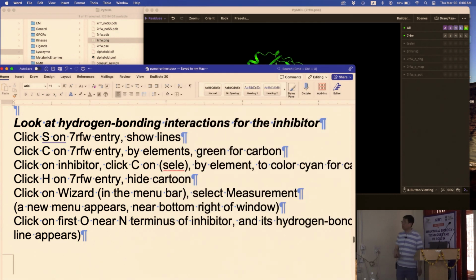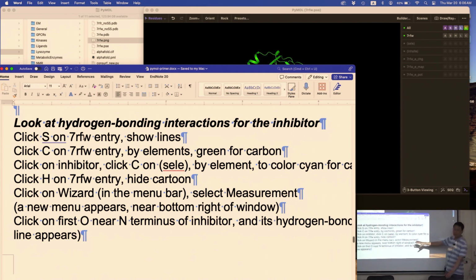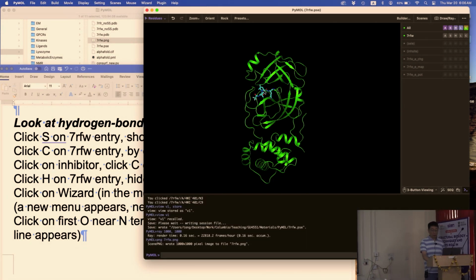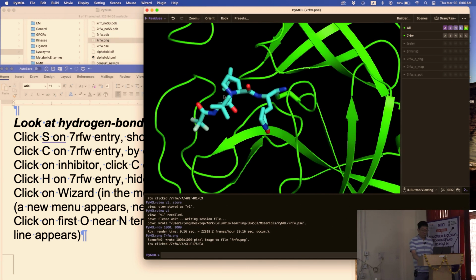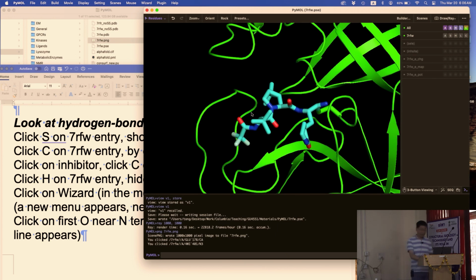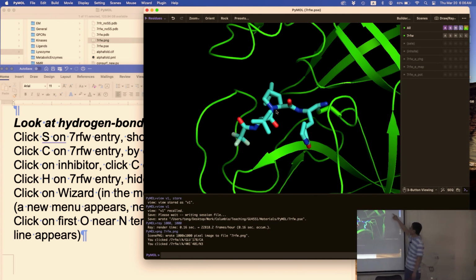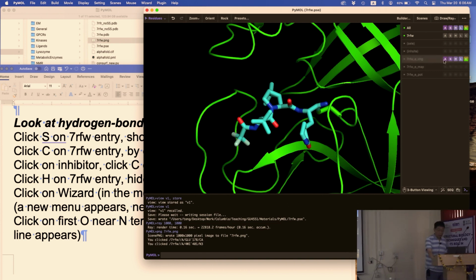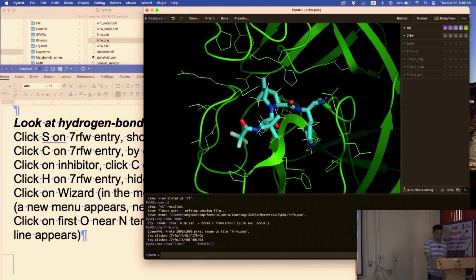So next thing was looking at secondary hydrogen bonding interactions between the compound and the protein. Okay, that's in your primer as well. So for this, we middle click on the compound again, zoom in. We should have saved the view that we found earlier, but anyway. Okay, and then we found all the residues nearby. That's this thing we showed right there. So let's go back there and say show as lines. So they all come back again. Right?